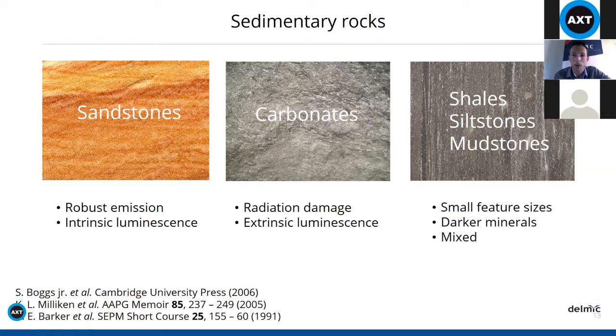And in carbonates, you have to be a little bit more careful when you do SEM and cathodoluminescence imaging, because the material is more fragile, and you can alter it with the electron beam. And so it's wise to do some tests where you test the current and the acceleration voltage that you're using, and the effect that it has on the material, because it can be more fragile. And this is one particular case where you can benefit from having a very sensitive cathodoluminescence detector like the Spark, because you can reduce the beam current that you're using and the damage that you are inducing in your material.